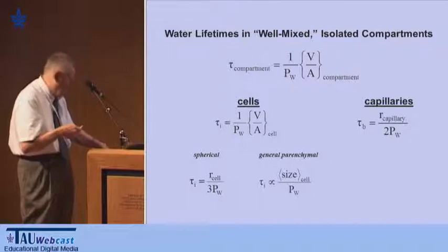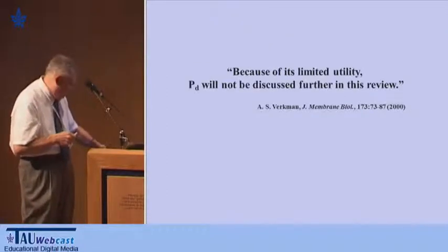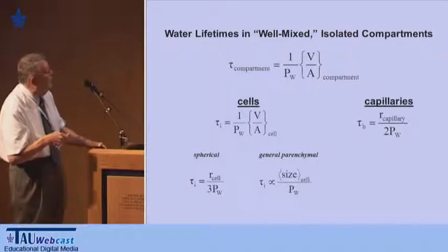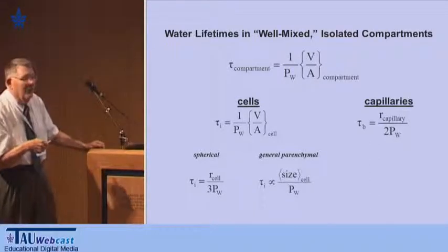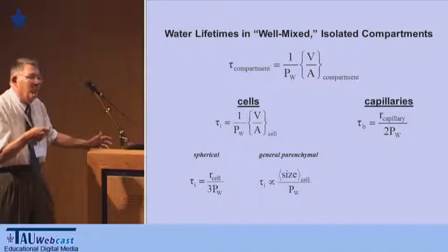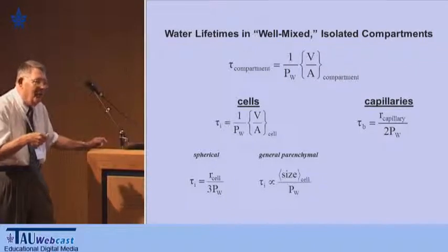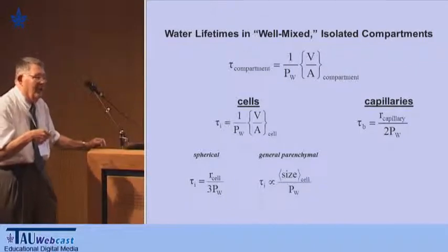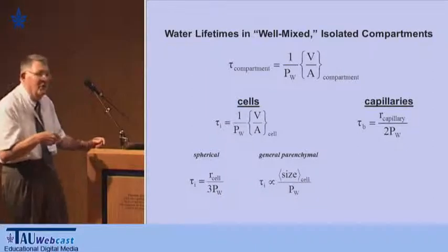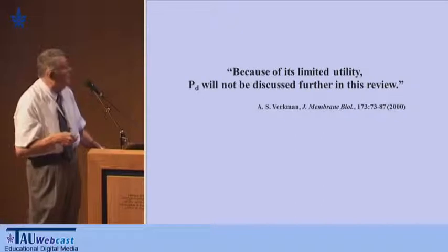If you calculate how many water molecules, you can calculate the flux. In fact, 1 over tau I is that rate constant. So if you think about the red cells, it means that on the average, the entire contents of the red cell is exchanged 100 times per second. And in the oocyte, it takes 100 seconds for the entire contents to get exchanged.